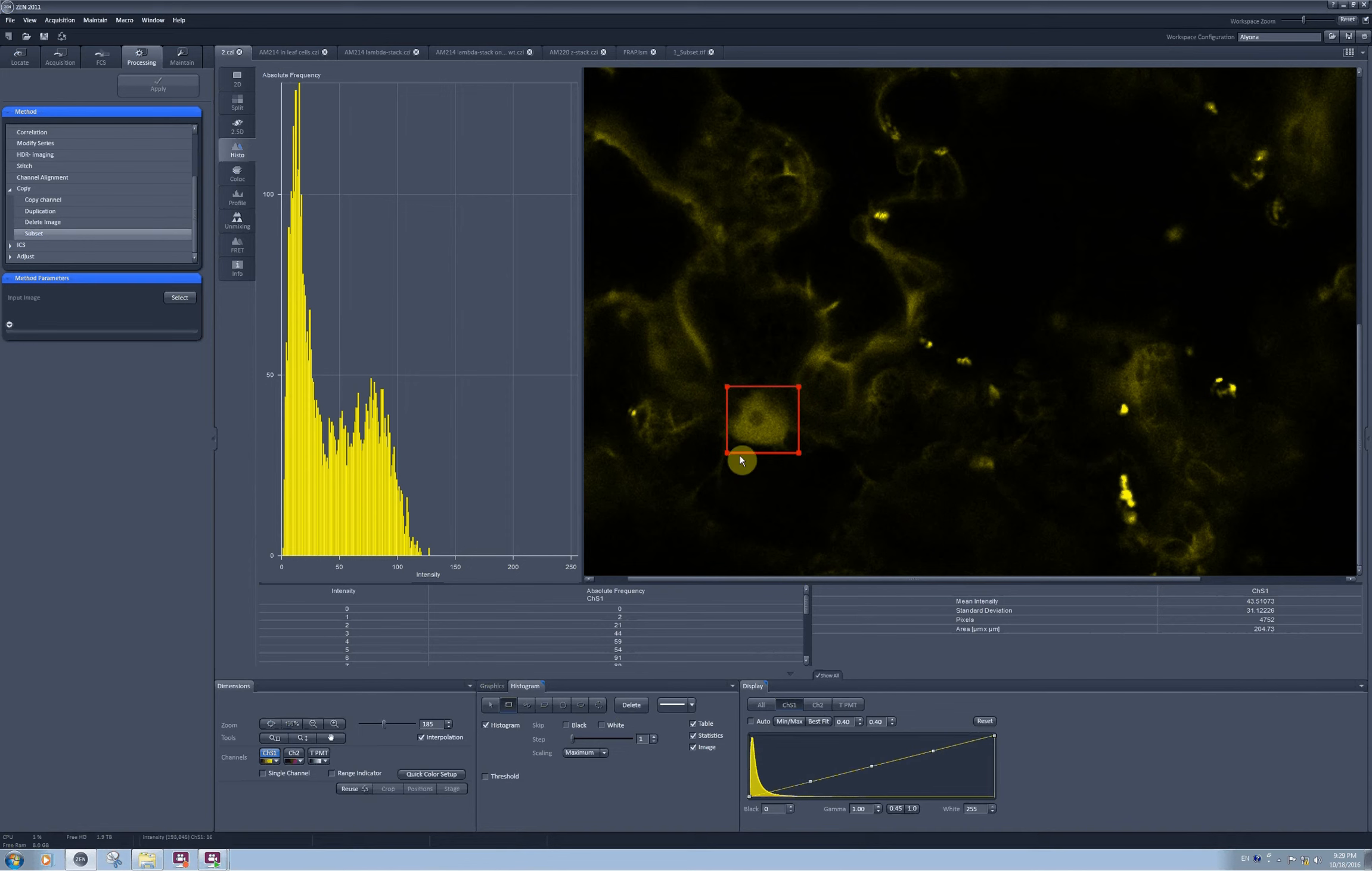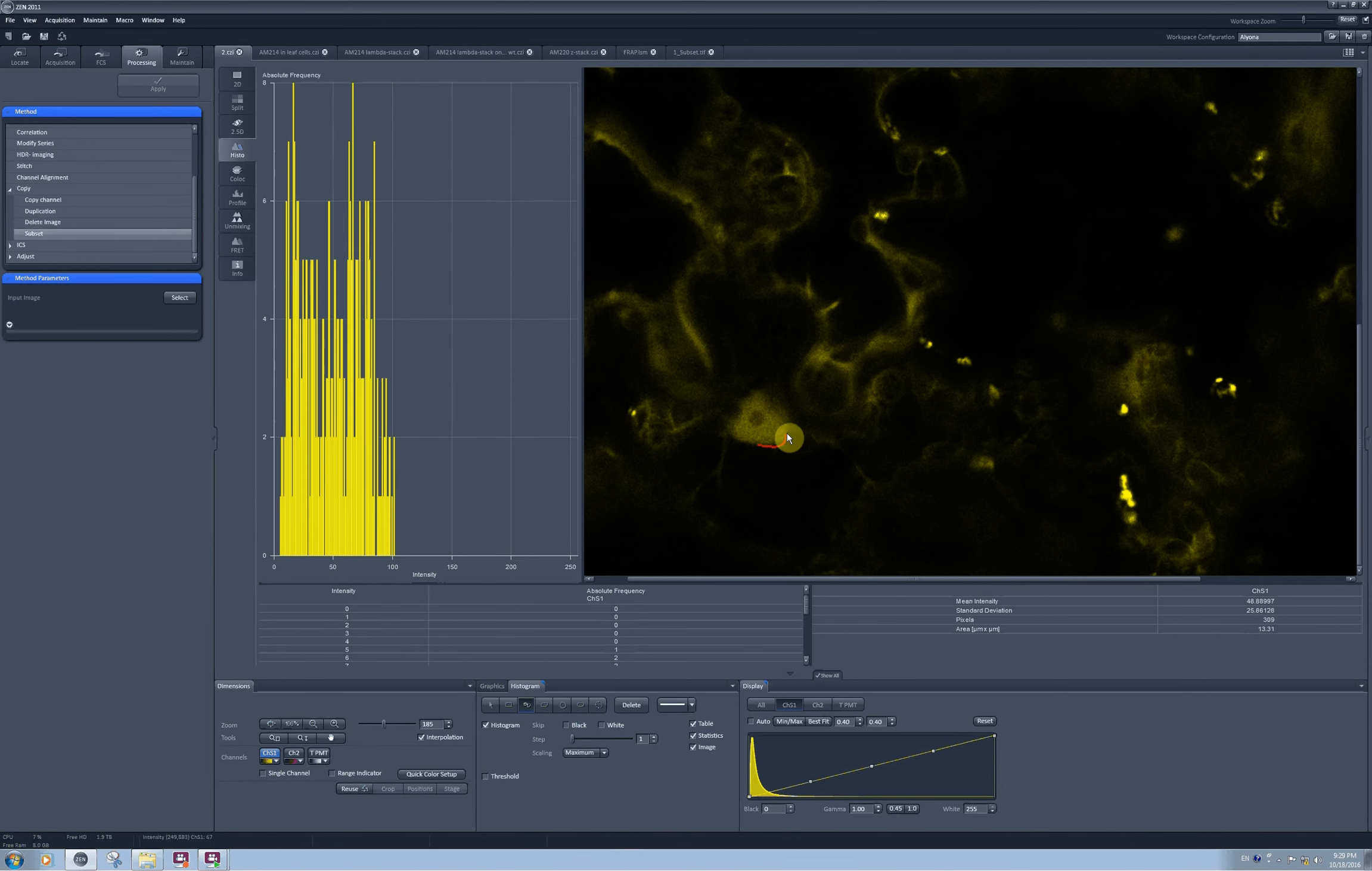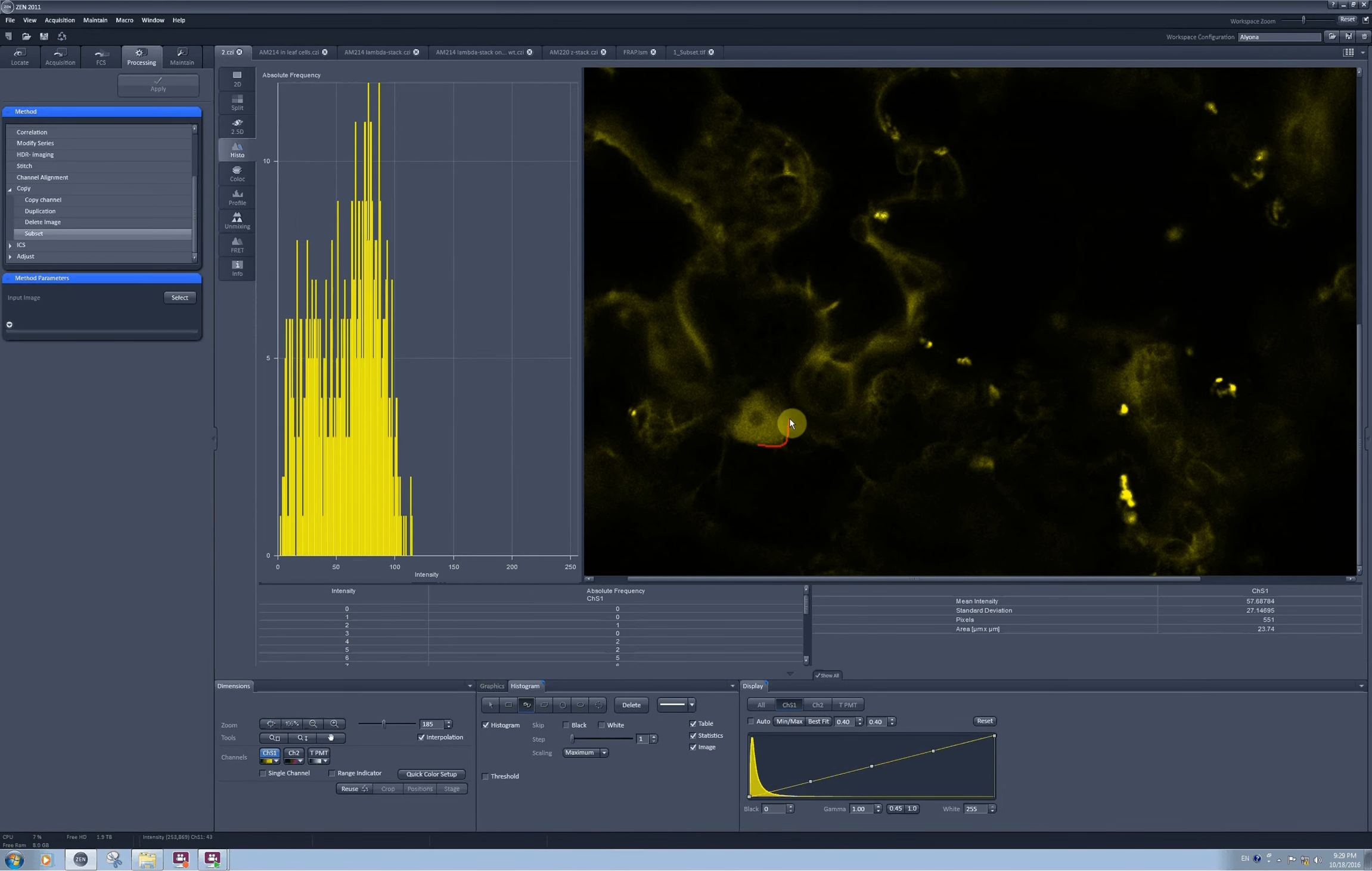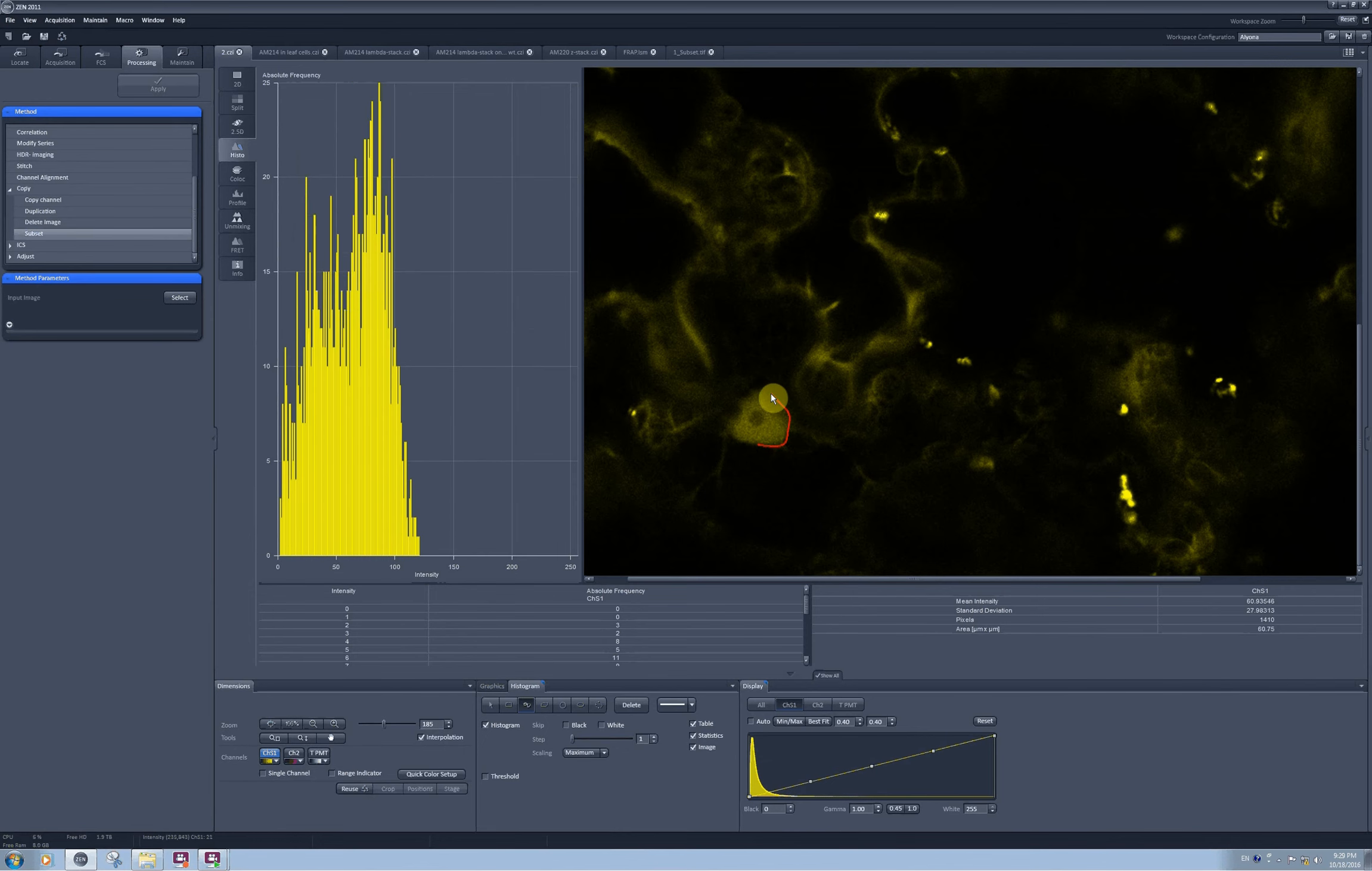To fit the selection best, I can erase the rectangle and select this closed bezier, and then I can very accurately draw around the nucleus.